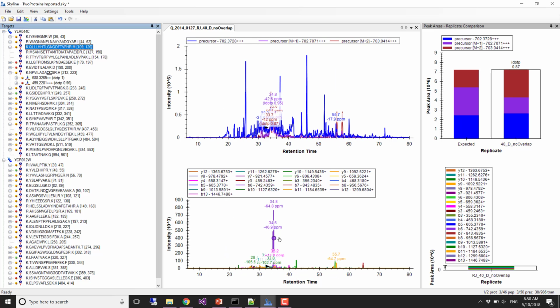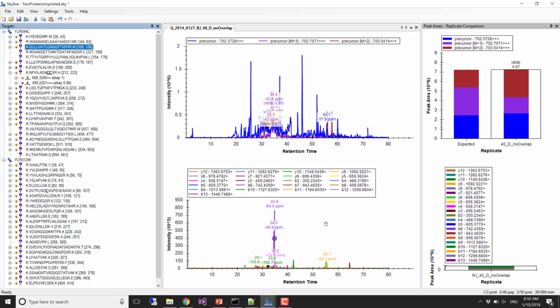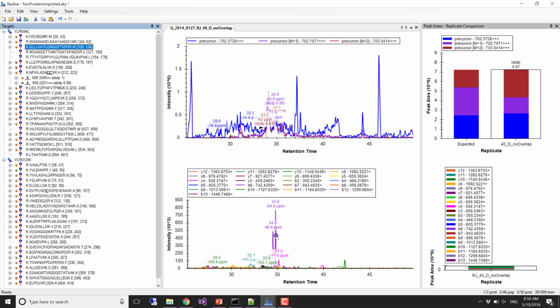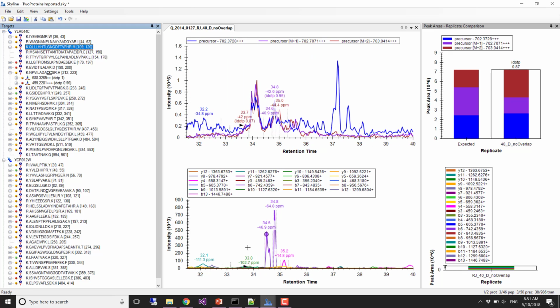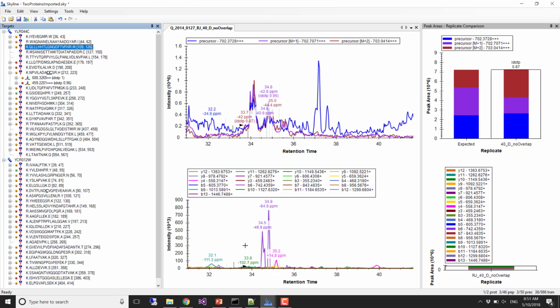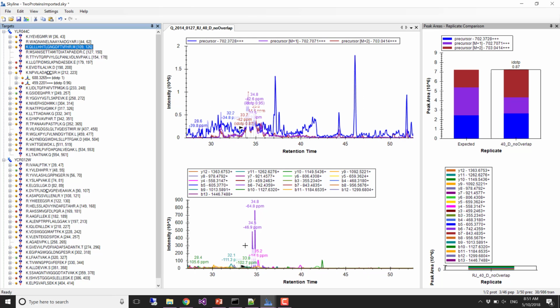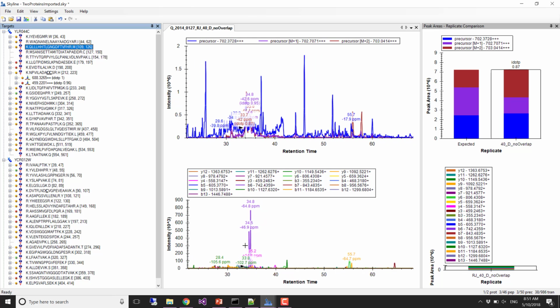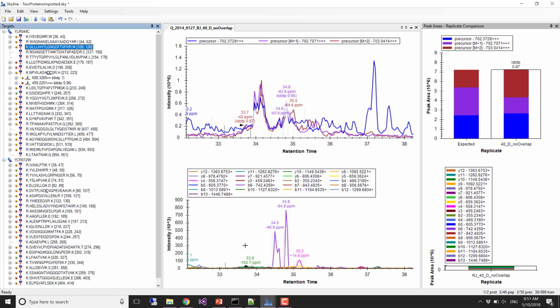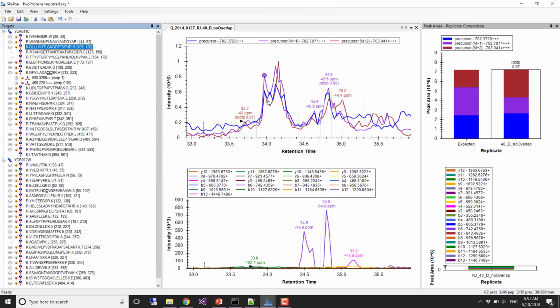If you're trying to figure out whether you can see things, actually having the full gradient extracted can be really confusing, right? It turns out that Skyline does a pretty good job, and there won't typically be a whole lot of other things than what Skyline picked, but it's really hard to know.